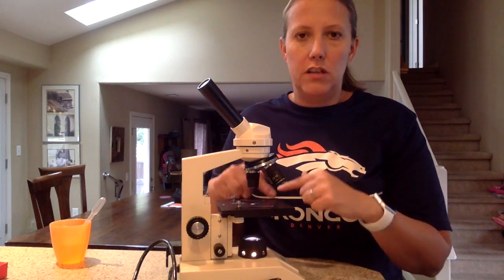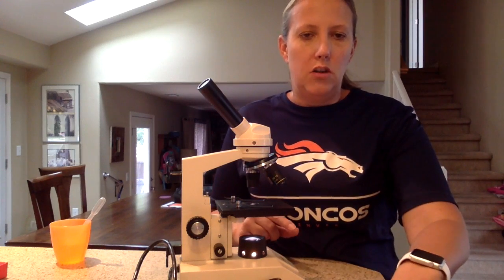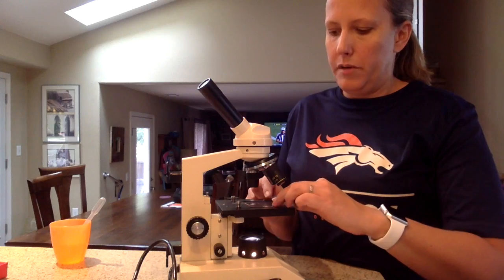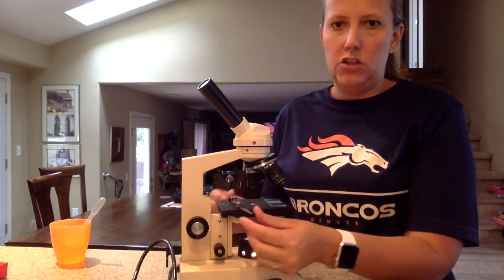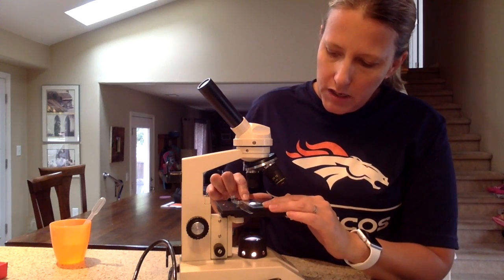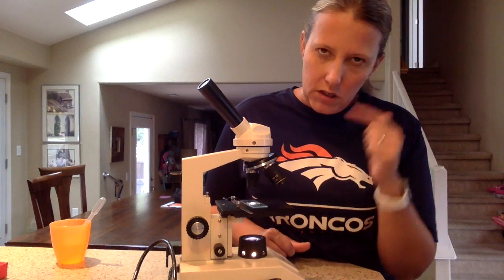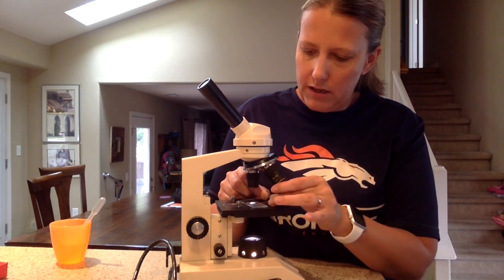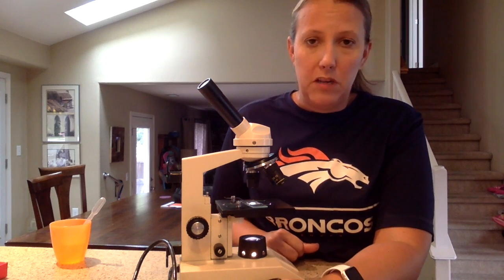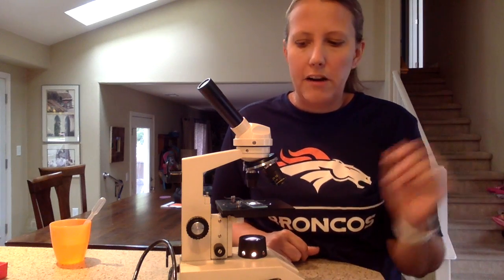Making sure that the stage is down, low-power is down, and the light is on. Then you're going to take your slide that you have prepared ahead of time and put it on the stage. Move the stage clips out of the way and put the specimen so it's directly over the light. Just looking with your naked eye, making sure the specimen is directly over the light, then lift up the stage clips and put them down to hold the microscope slide in place so it doesn't slide around.